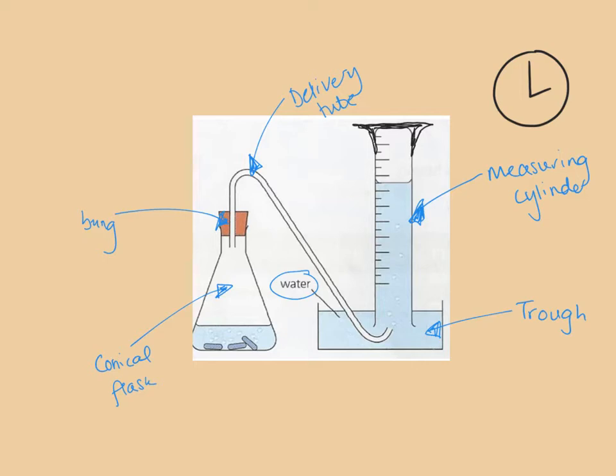So in here we've got your reacting materials, so these are your reactants. This is the only place where the reaction actually takes place. This is all for detecting the volume of gas produced. So your reaction's taking place, and this particular reaction produces a gas. That gas travels up through the delivery tube, down to here, and comes out underwater, and that's what this water's for, because when the gas comes out under here, it will produce bubbles.